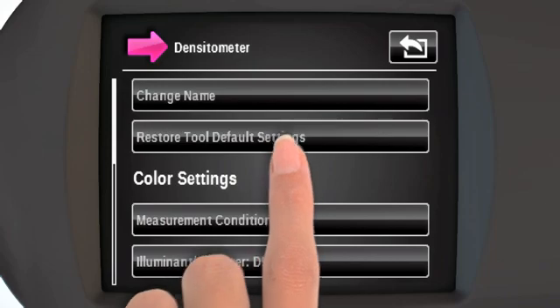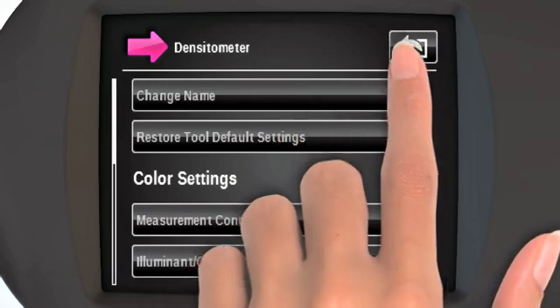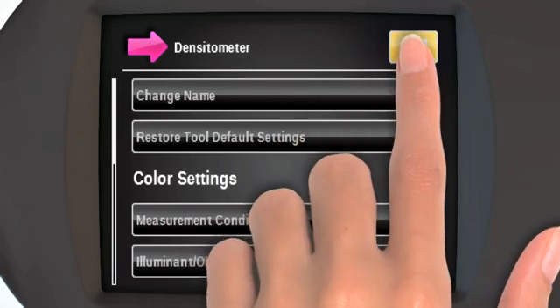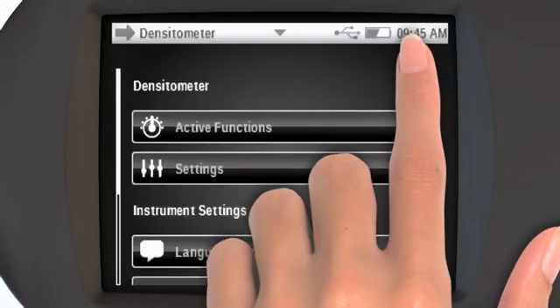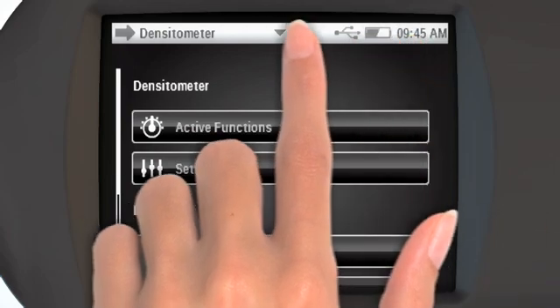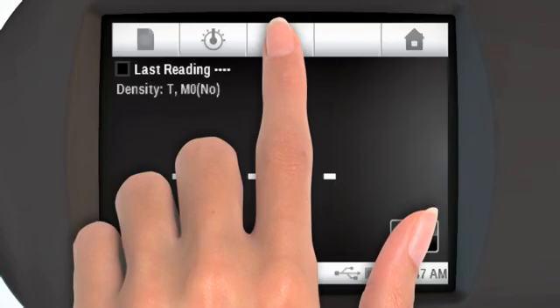To leave the settings window, tap the back button. To return to the tool, tap on the arrow at the top of the window.